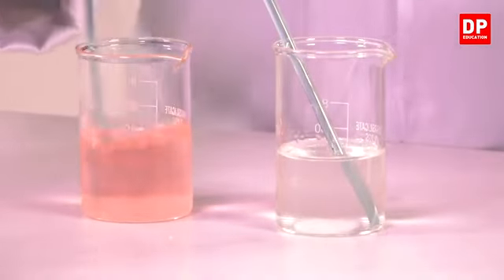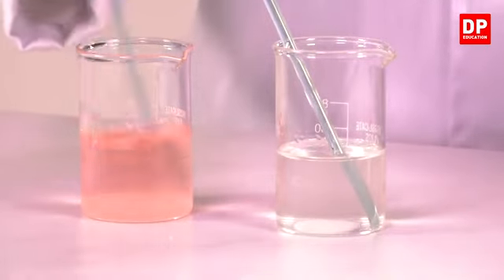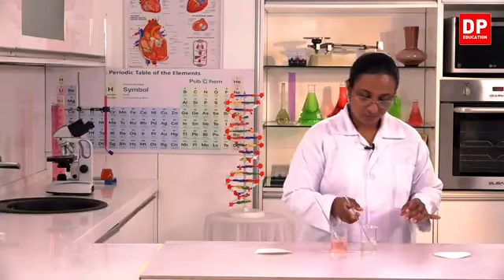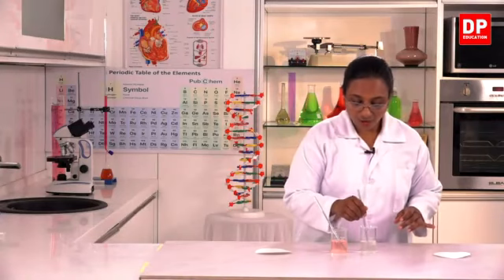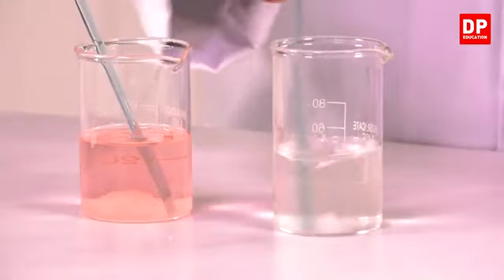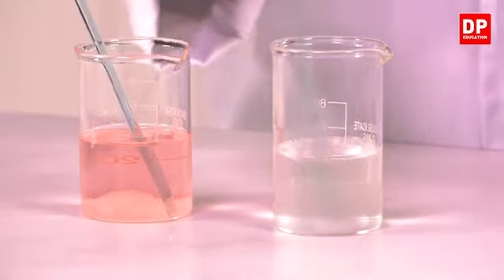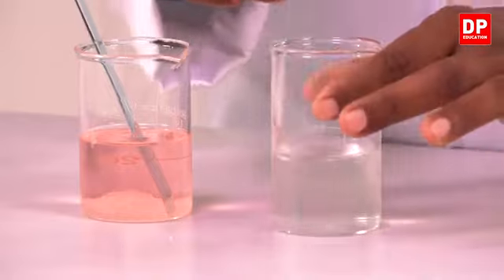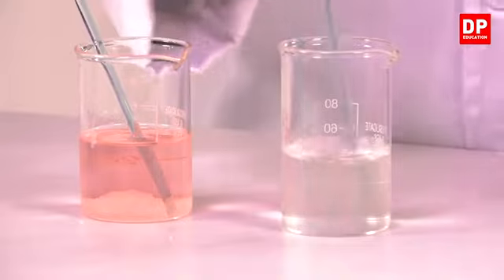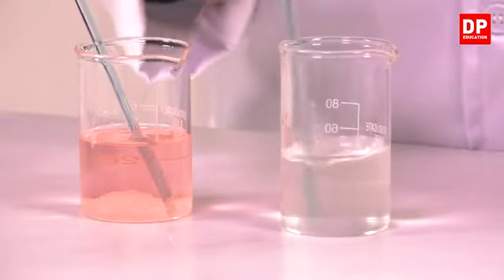Same way I try to dissolve sugar in kerosene. Already you all can observe a small difference in the solubility. You can see sugar is dissolving fast in water, but almost all the sugar is remaining in kerosene. Nothing seems to dissolve in kerosene. So here almost all the sugar is dissolved in water.